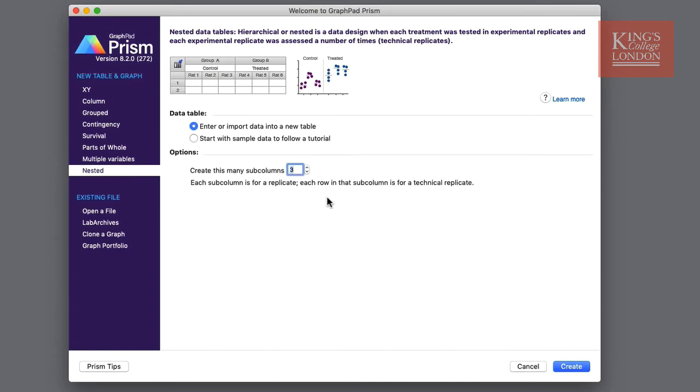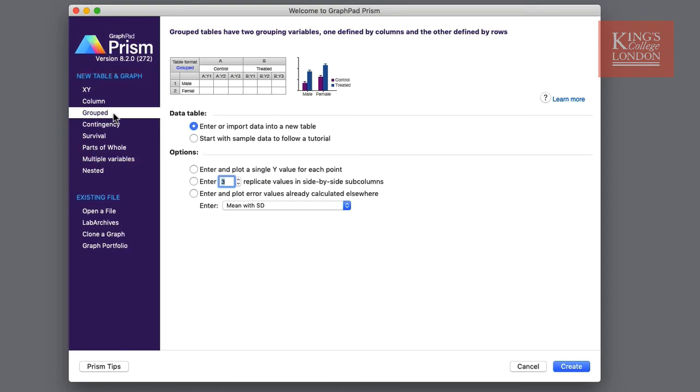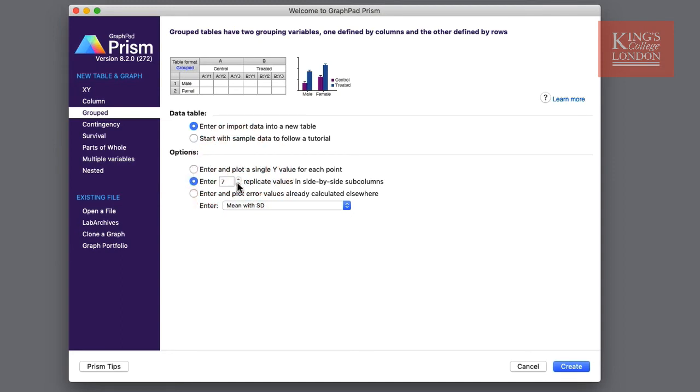A useful feature shown here in the Grouped graph is the ability to enter n numbers. For instance if you know the experiment has had an n of 7 you can simply dial up 7 in the replicate values which creates side-by-side sub columns in order to enter your replicates.